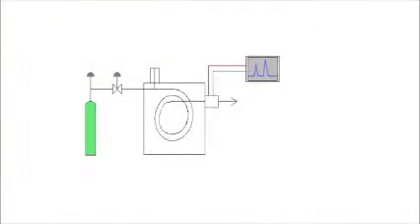We begin by injecting a small sample of liquid through a silicone-coated rubber septum. The substance then enters the injection port, which is kept at a constant temperature high enough to flash vaporize our liquid sample into a gas, but not so high that it will denature the sample. Once the substance is flash vaporized, a carrier gas carries our substance through the column.